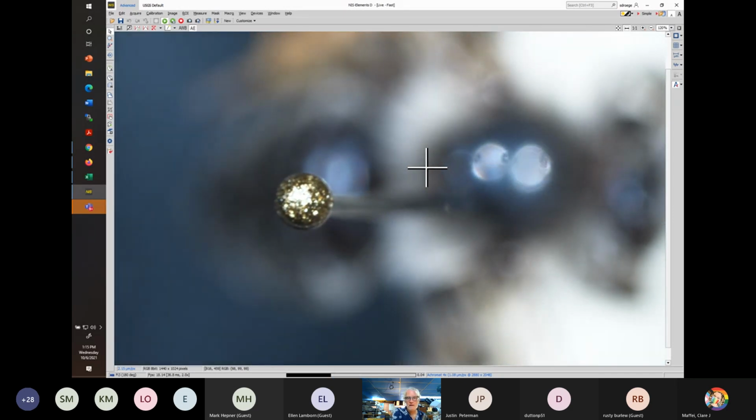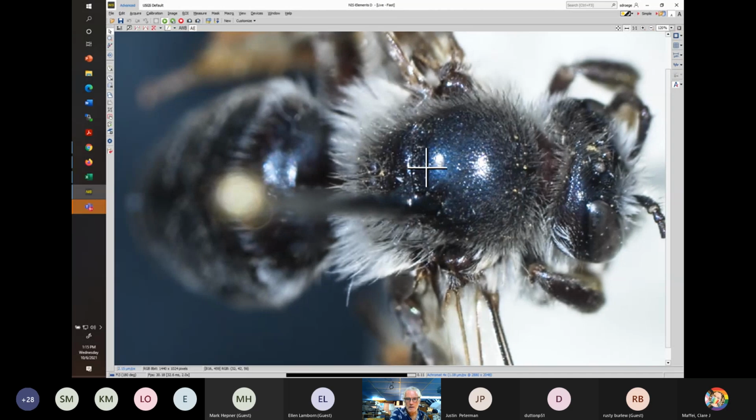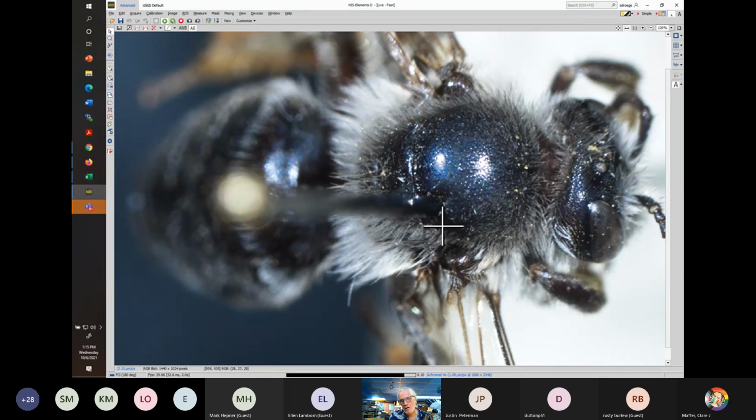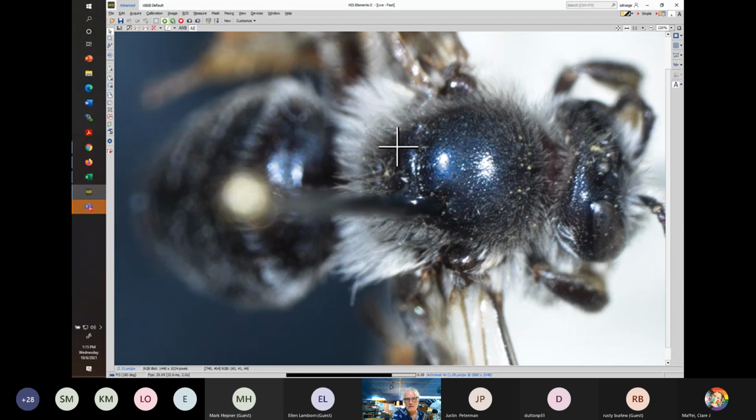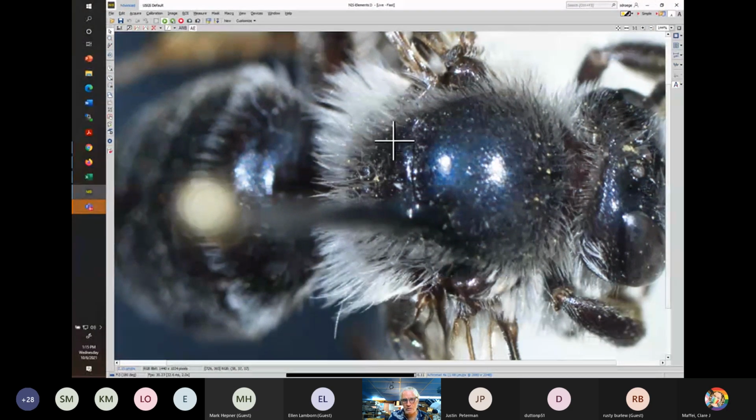Let me dive in there. We've shown this early on, so I don't really need to repeat it, but the axilla are these segments which are difficult to see because the suture lines are hidden by the overall darkness of the segment, but the axilla would be here. But you can see they don't form points. They are in the same shape as the scutellum.